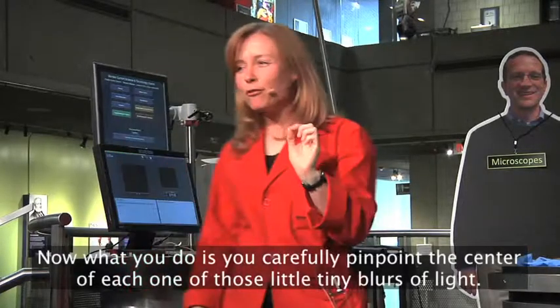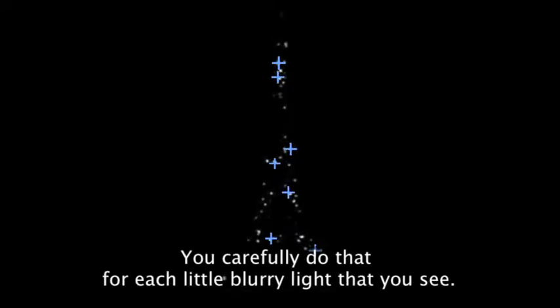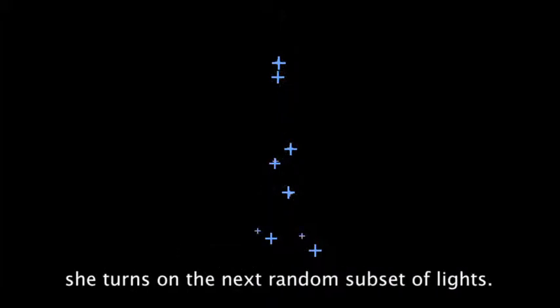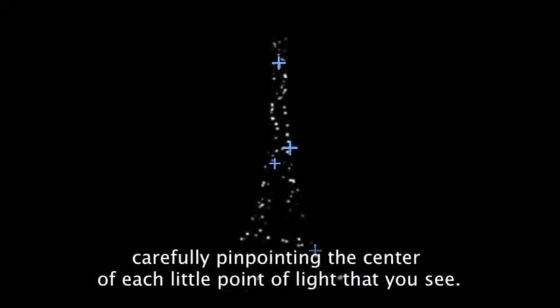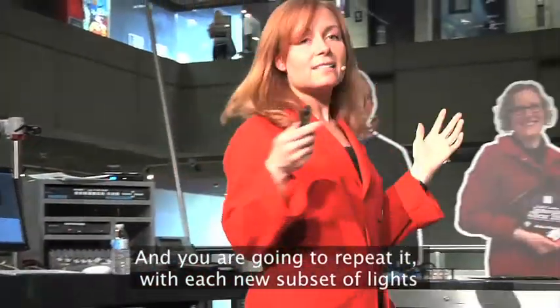Now what you do is you carefully pinpoint the center of each one of those little tiny blurs of light. You carefully do that for each little blurry light that you see, and when she turns off the lights, she turns on the next random subset of lights. And again, you repeat that process, carefully pinpointing the center of each little point of light that you see. That process is called localization. And you're gonna repeat it with each new subset of lights over and over and over again.